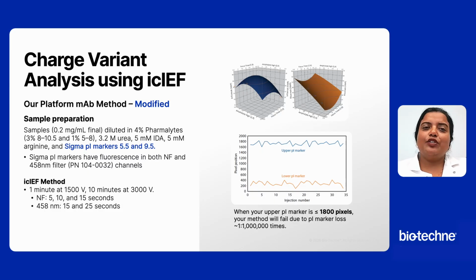Now, moving on to the charge variant analysis using the icIEF applications of Maurice. In addition to being the gold standard for charge heterogeneity analysis, icIEF has long been known to be a stability indicating method for a variety of molecules. Here, for this application note and for the molecules we were studying, this is our platform method for mAbs. And for analyzing the ADCs, modifications were made to switch the pI marker because some ADCs have 458 fluorescence. There are a couple of different fluorophores on these pI markers, but these ones work out best and really nicely because they are fairly equal in both the channels.